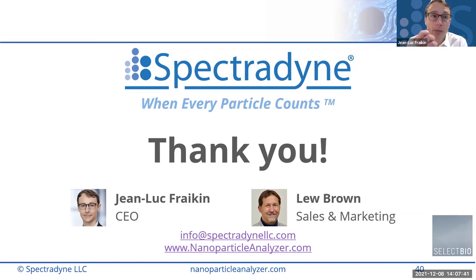There's a question from Ximin Chen. What are common diluents used for sample dilution? Most people use PBS with tween in it as a wetting agent. That's by far the most common and the most well-characterized sample. As I mentioned, you can use other wetting agents. Most people use PBS because it's compatible with their biological samples.